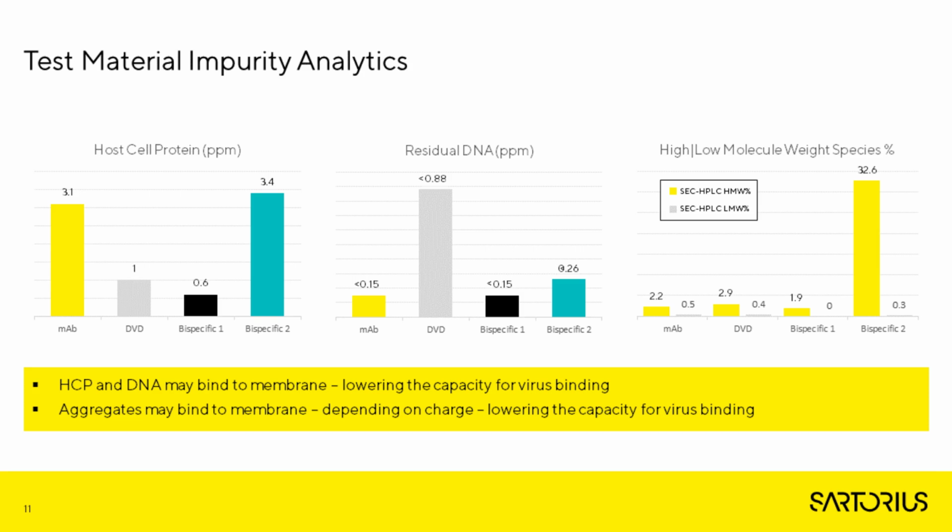In fact, cation exchange media is often more effective for binding of aggregates. However, there may be some acidic species of these aggregates that may bind to the membrane and affect the virus clearance.